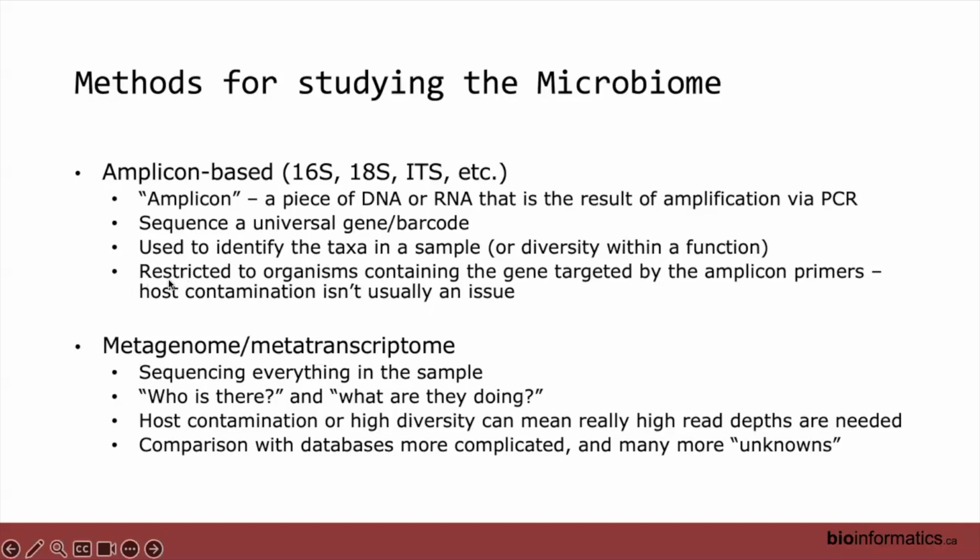And this means that it's kind of restricted to the organisms that actually contain the gene that we're targeting. But host contamination isn't usually an issue here.